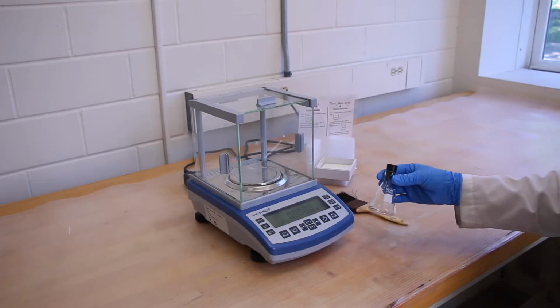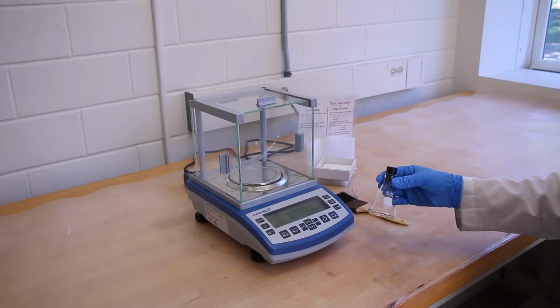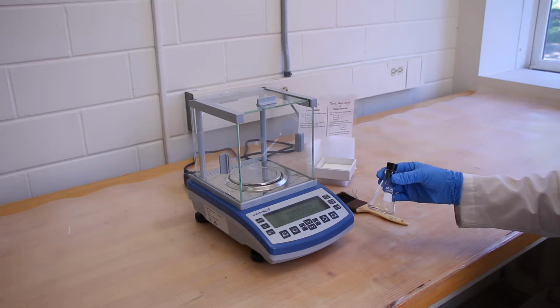In step 4, we will weigh a clean, dry, and stoppered 50 milliliter Erlenmeyer flask. Please record this value on the data sheet in the water column in the mass of flask and stopper row. Record all digits of the balance with units.